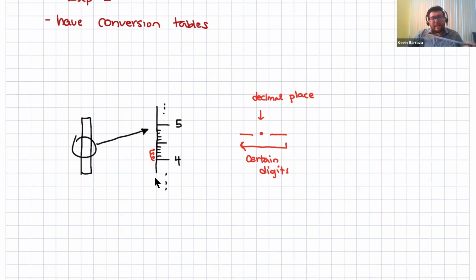So we've just identified that the centimeter ruler goes by 0.1, 0.2, 0.3. So it goes all the ways to this point. But because there's a little bit of space that's been specially designed by the manufacturer, we can estimate that little bit further. That's our next digit. So this is our estimate.